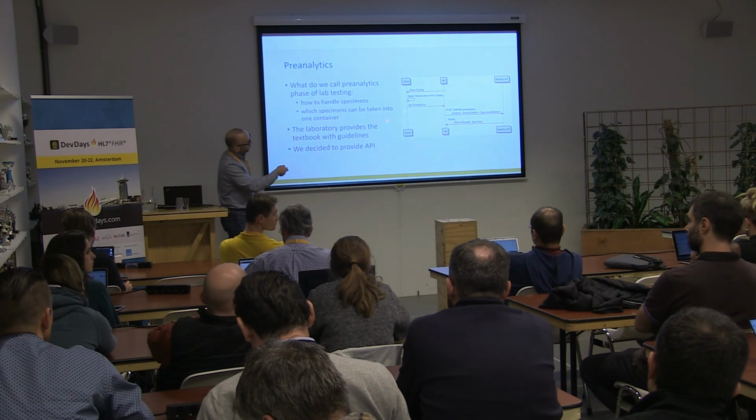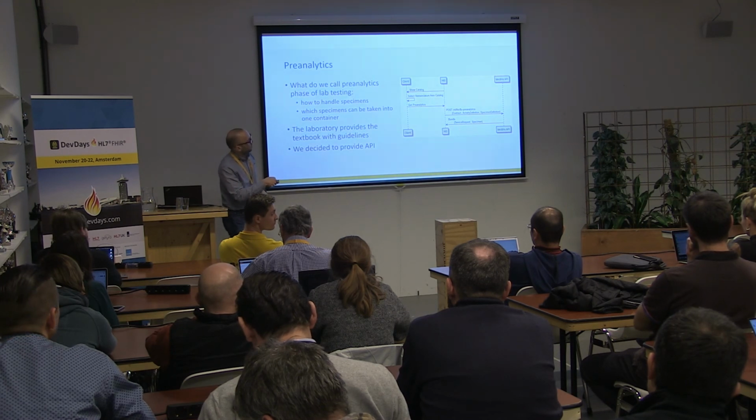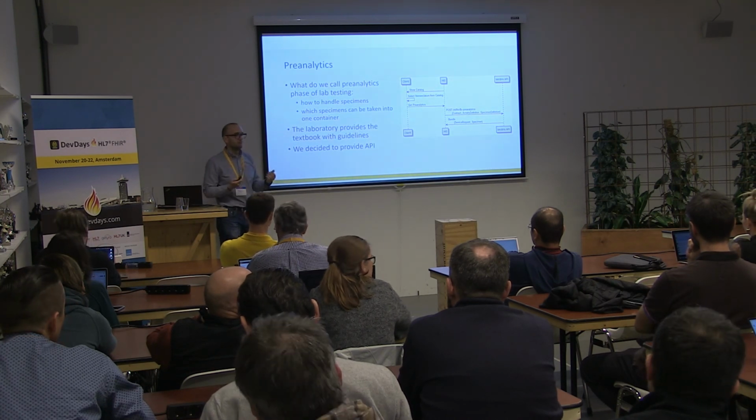So if you would like to send them label information, we put it in an extension of Specimen. An extension of Specimen. Yeah. I haven't mentioned it here.